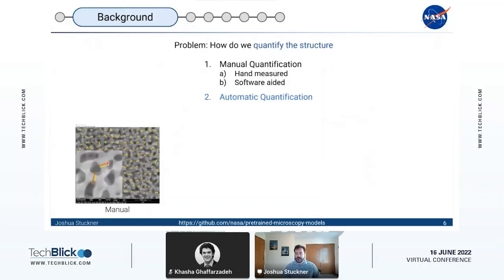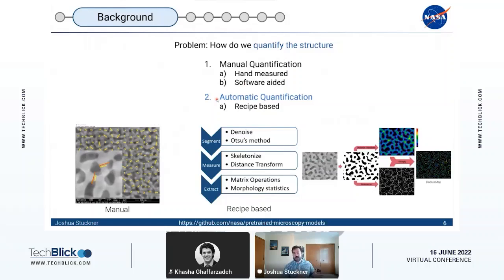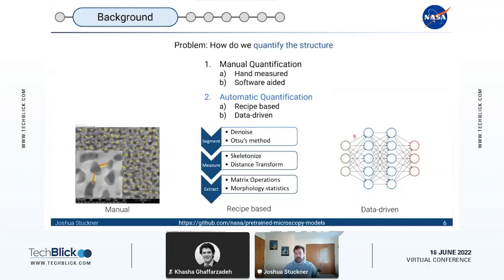There's several different approaches for this. One is recipe-based where we design some bespoke computer vision algorithm to maybe perform segmentation, find the backbone along the ligaments, and calculate the distance. Then we'll do some matrix operations to get a radius measurement along every single pixel along the backbone. Or more recent approaches are more data-driven where we input the image into the model and just extract some latent feature vector. So the technique that we've developed will improve the segmentation step for recipe-based and also the data-driven.